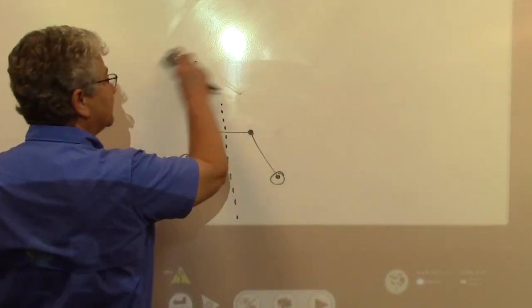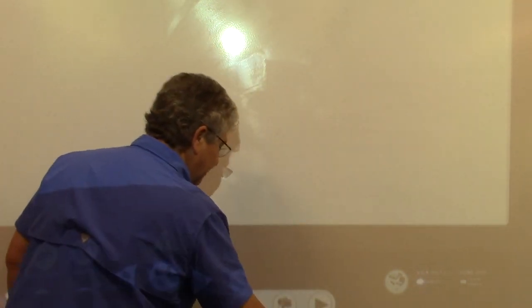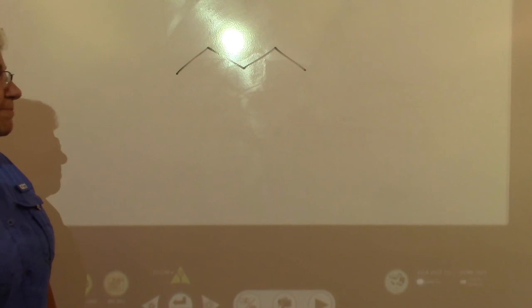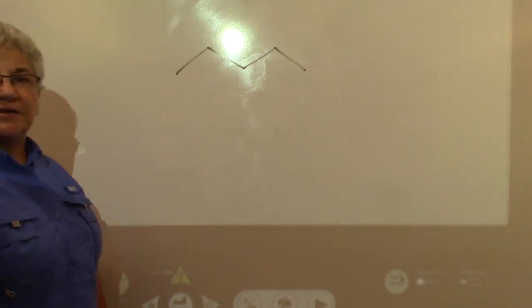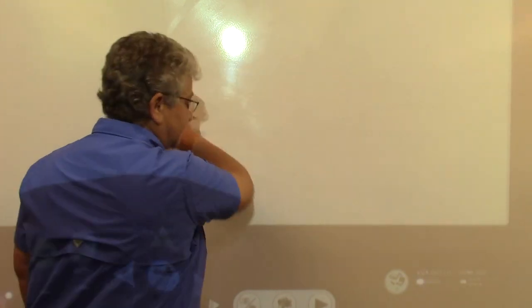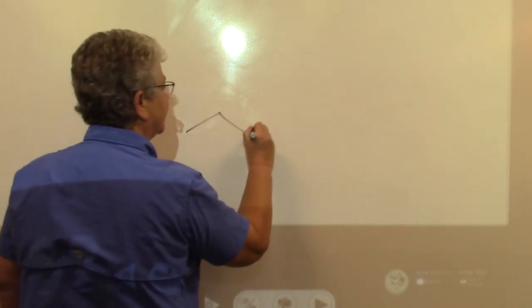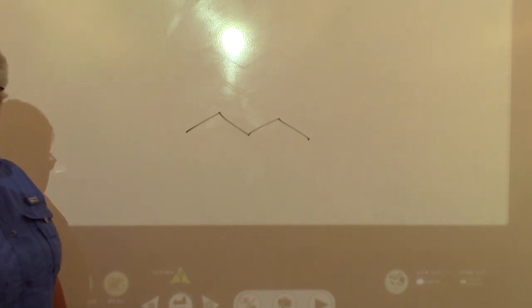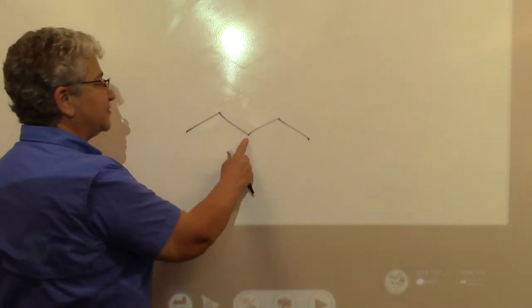Let's talk about pentane. Here's pentane. How many peaks do you expect to see in pentane? CH2, CH2.